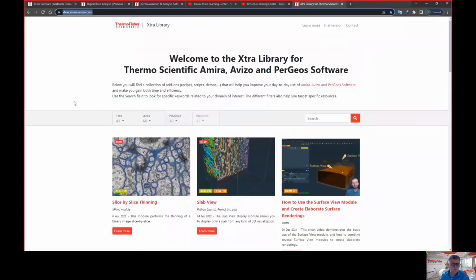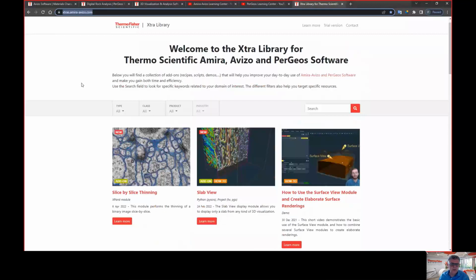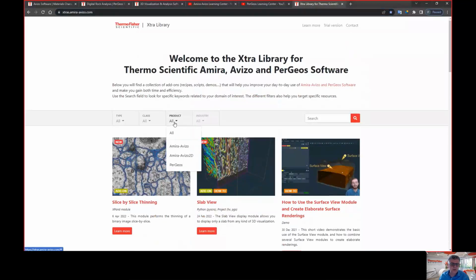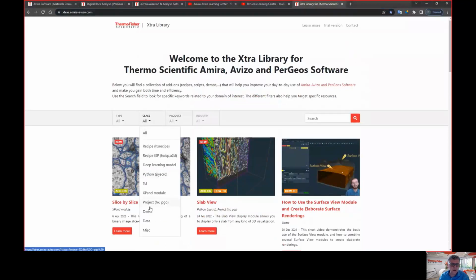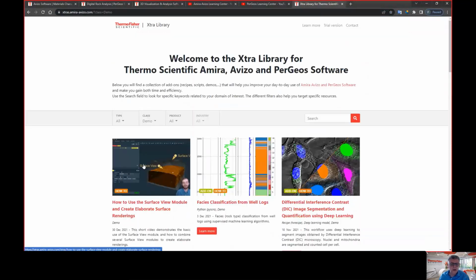So how does it work? You have this portal and you have a lot of stuff here. Some of these are just, let's say, a video tutorial, for example, a demo, or somebody showing you how to do things. Some are really Python modules.